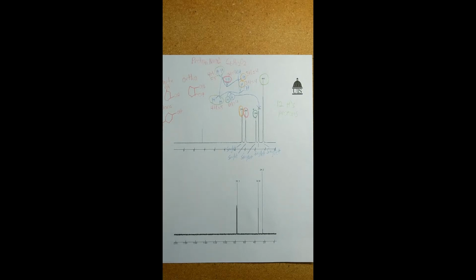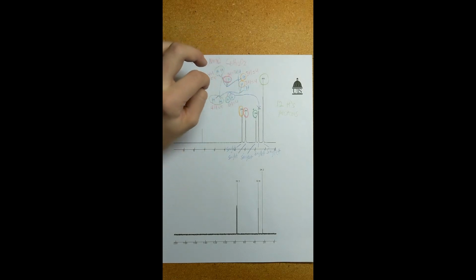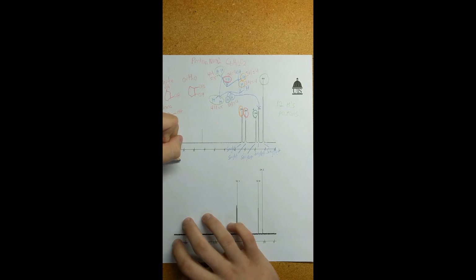So now we have a structure that lines up well with this proton NMR, and one can see why things are shifted with this chair structure due to the axial and equatorial nature of the alcohol groups. Even though it is slightly confusing with these two protons being in their own environments, we now have a solid structure that can represent this well. So we have completed proton NMR, and we are going to move on to carbon NMR. I'm going to go ahead and label that for us.